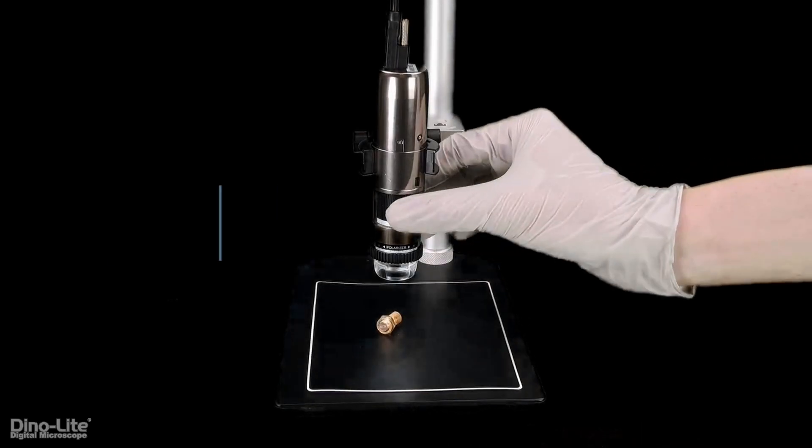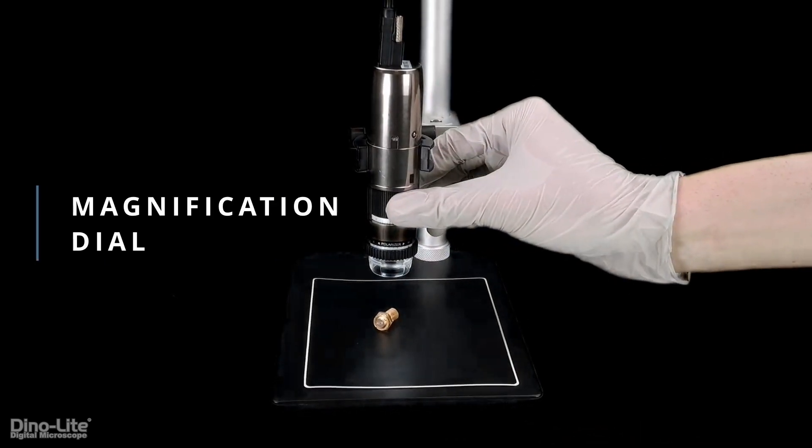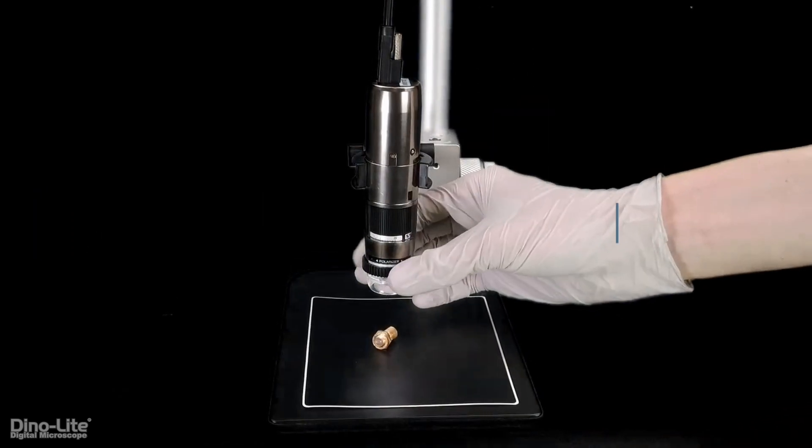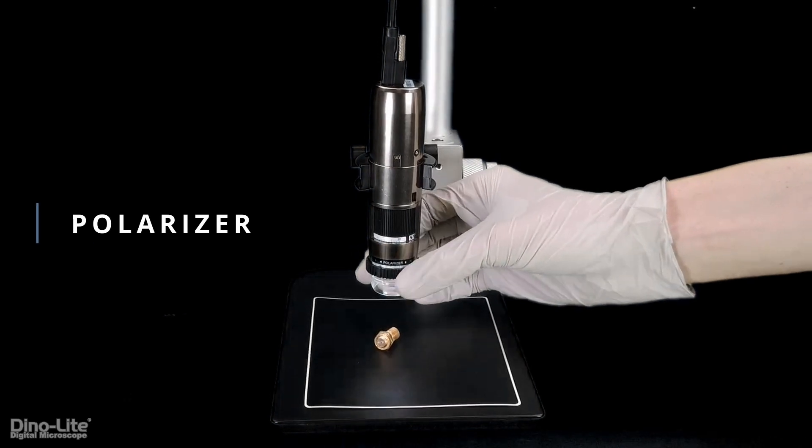Just below the scroll lock is your scope's magnification dial and polarizer, which you can use to adjust your scope's magnification or reduce glare, respectively.